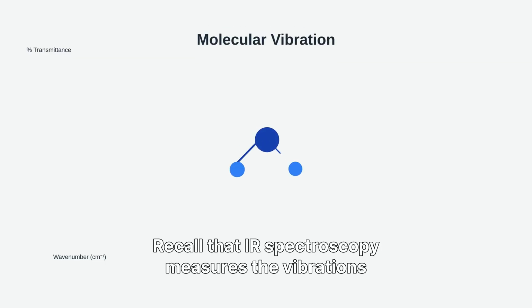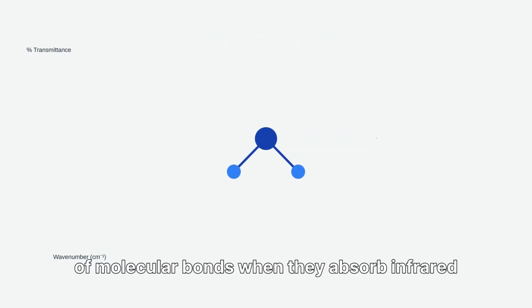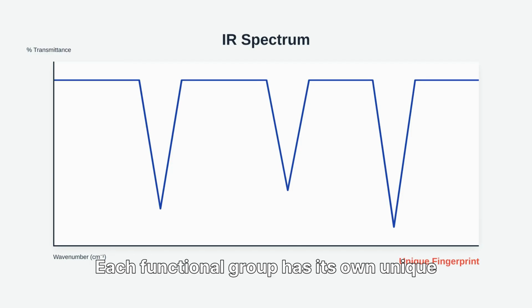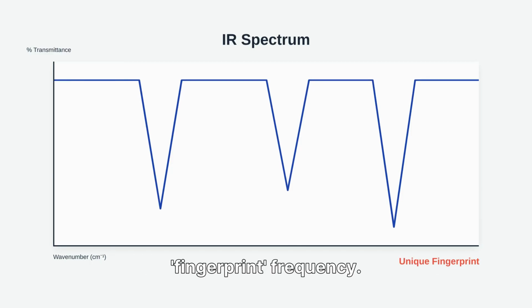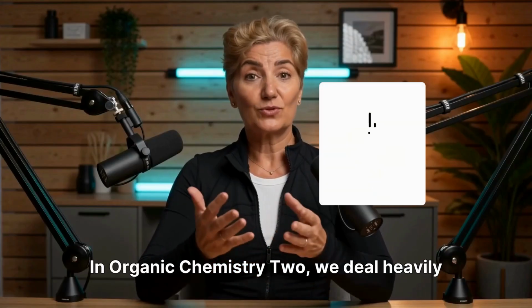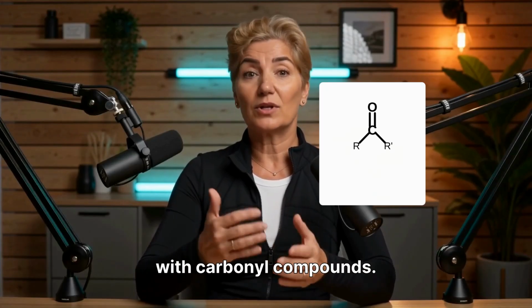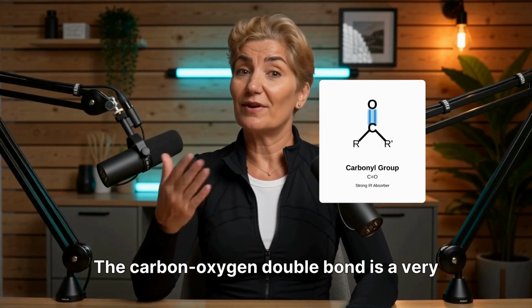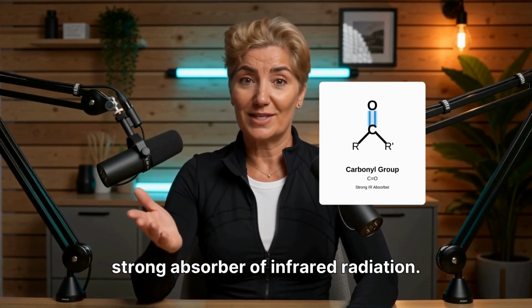today we're diving back into infrared spectroscopy, specifically focusing on how we identify one of the most common functional groups, the ketone. Recall that IR spectroscopy measures the vibrations of molecular bonds when they absorb infrared light. Each functional group has its own unique fingerprint frequency. In organic chemistry too, we deal heavily with carbonyl compounds. The carbon-oxygen double bond is a very strong absorber of infrared radiation.